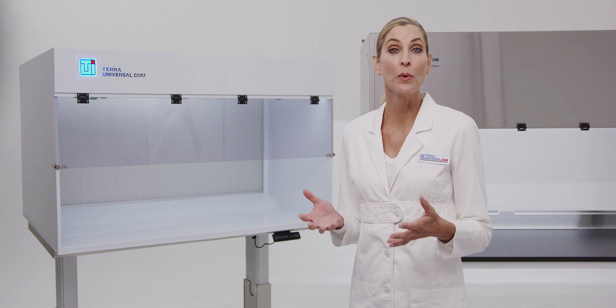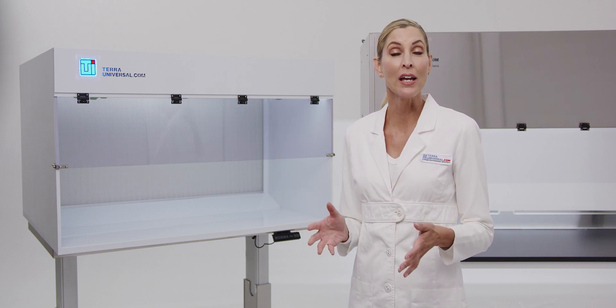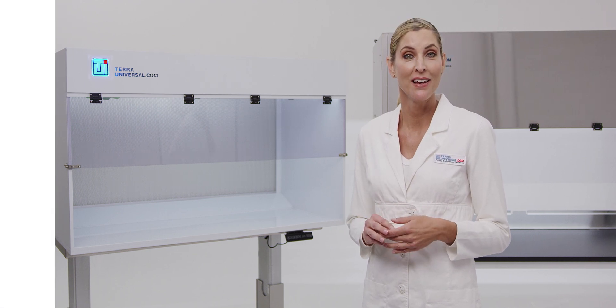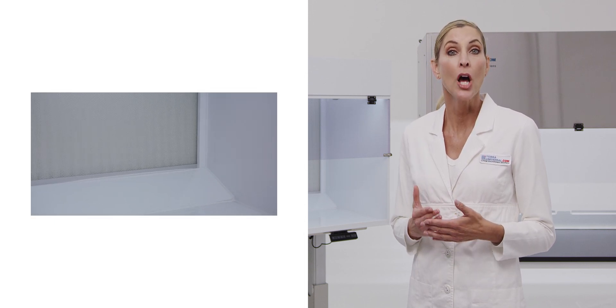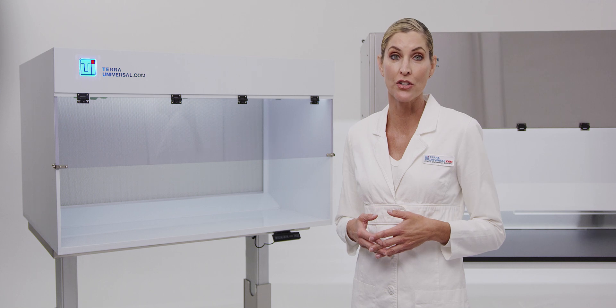Tara's ValueLine WhisperFlow Benchtop Horizontal Flow Hoods turn any work area into a sterile, HEPA-filtered, ISO class 5 environment. Tara's ValueLine hoods feature a one-piece enclosure composed of chemical resistant polypropylene for light-duty wet chemistry, mushroom cultivation, or non-hazardous cell culture research.